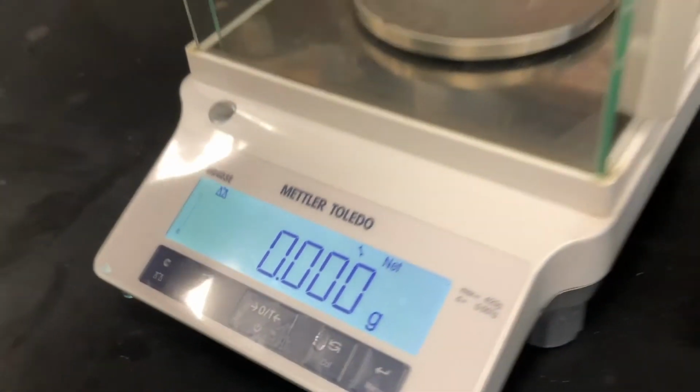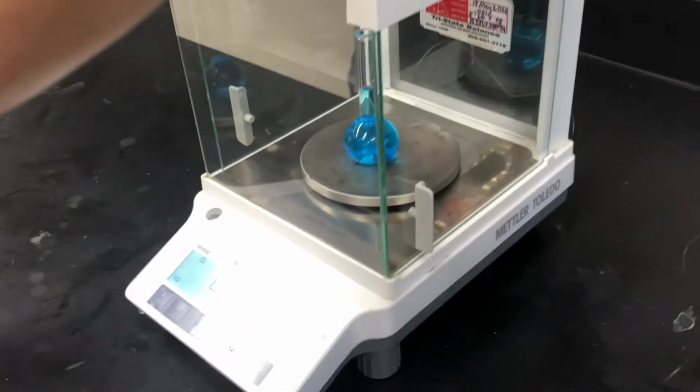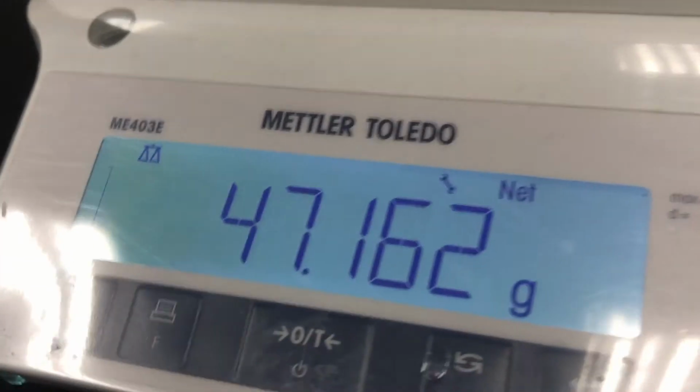Now that we're finished, we clean the area. We need to wipe down the tables with wet paper towels to remove the sticky residue. The chemicals are just sugar and water, so they're pretty harmless. We can just pour them down the sink.